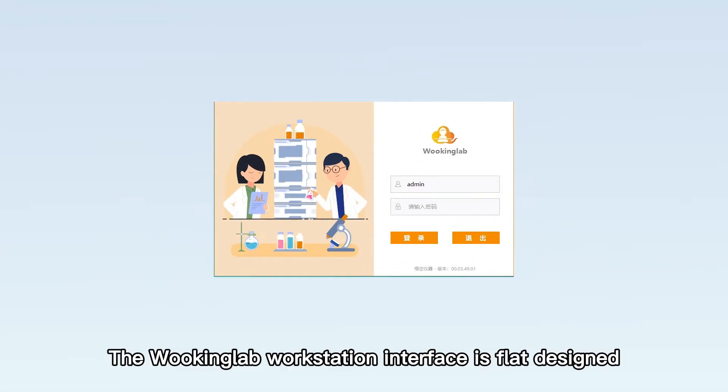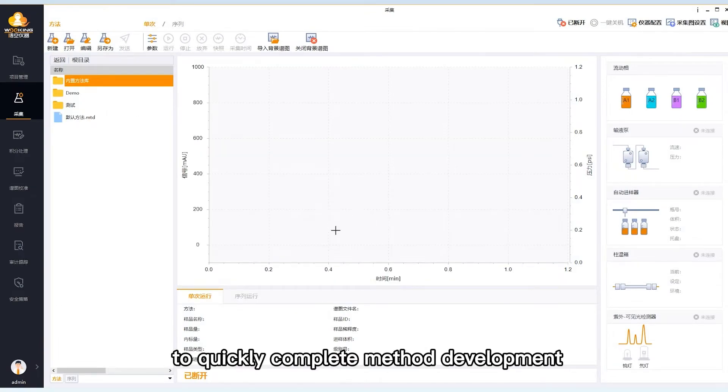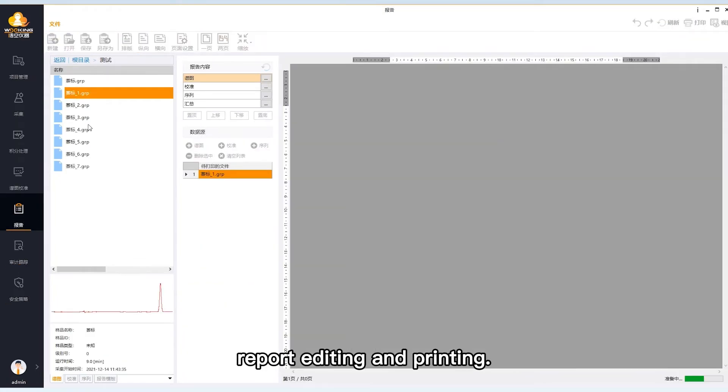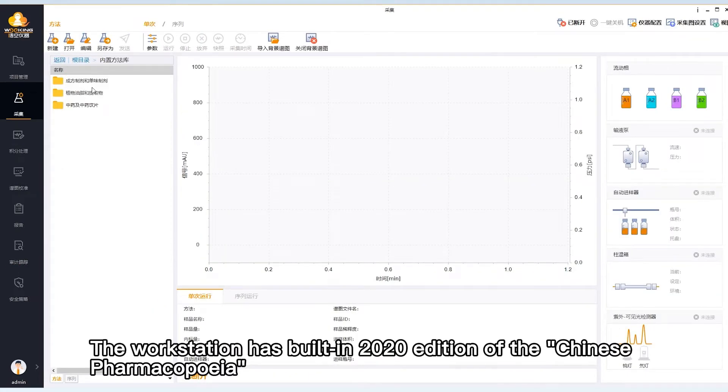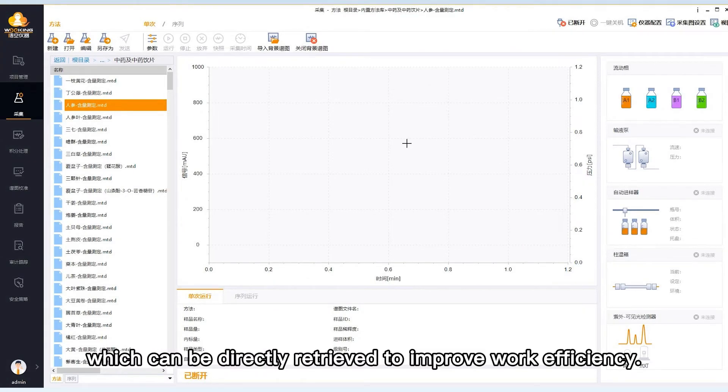The Wuking Lab workstation interface is flat designed to quickly complete method development, data acquisition, data processing, report editing and printing. The workstation has a built-in 2020 edition of the Chinese Pharmacopoeia and Chinese Veterinary Pharmacopoeia Standard Method Database, which can be directly retrieved to improve work efficiency.